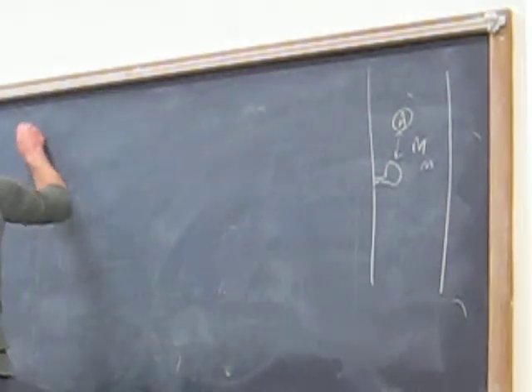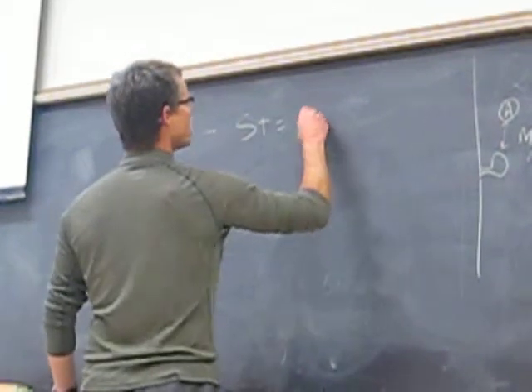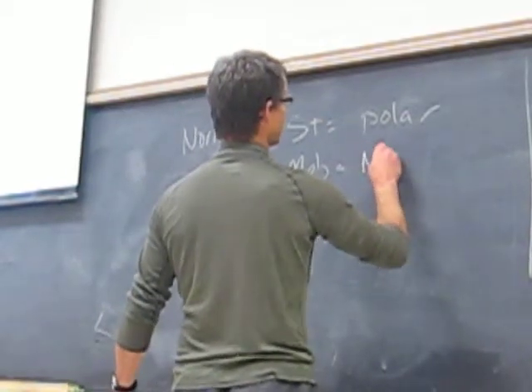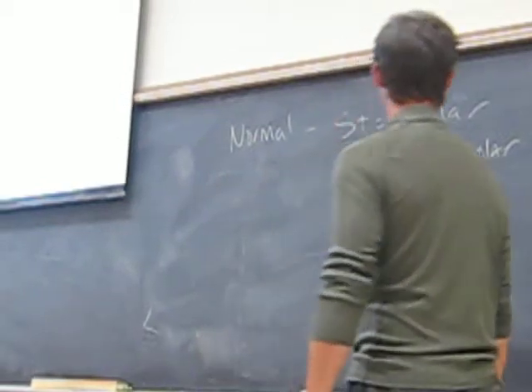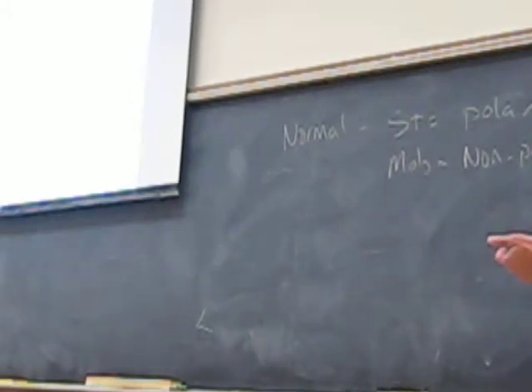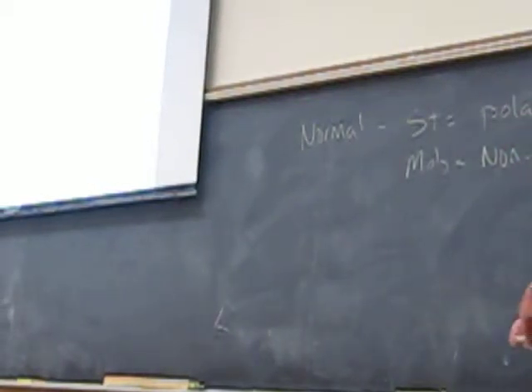And so in normal phase, the stationary phase is polar, and the mobile phase is the opposite, non-polar. And now, depending on what the chemical characteristic of the molecule is, it'll partition more strongly in one or the other. You would vary these parameters of mobile phase to sort of select that degree of interaction.